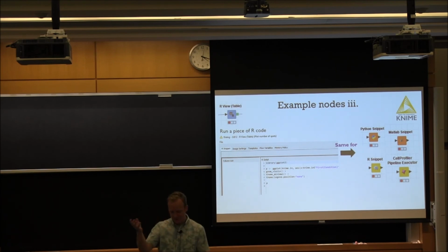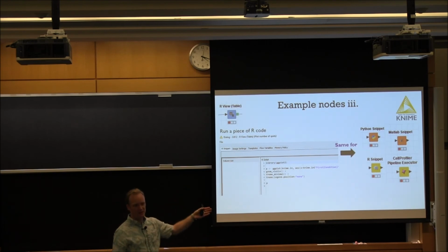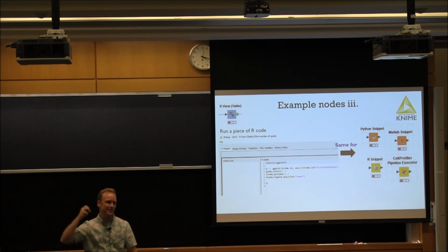So you're asking about particle tracking. For pipelines where I've done particle tracking, I'd read in my images, and the pipeline would then use ImageJ to do some pre-processing, and use TrackMate, and you get trajectories. Then that trajectory data is going to be XY coordinates. On that, you can run a math node, and then there you are. And then you have your table, and you plot the MSD.